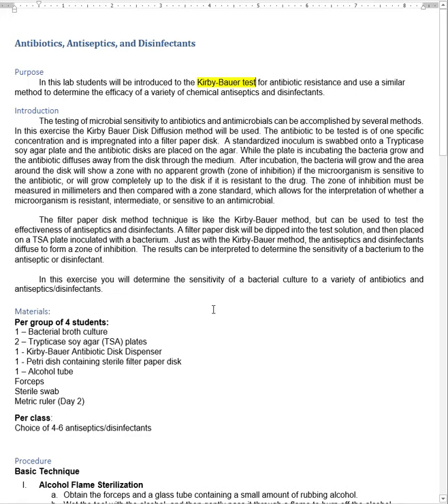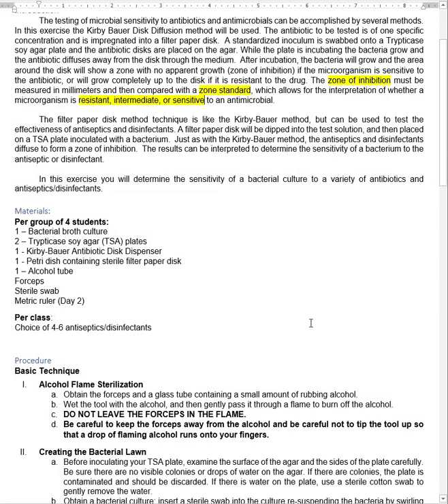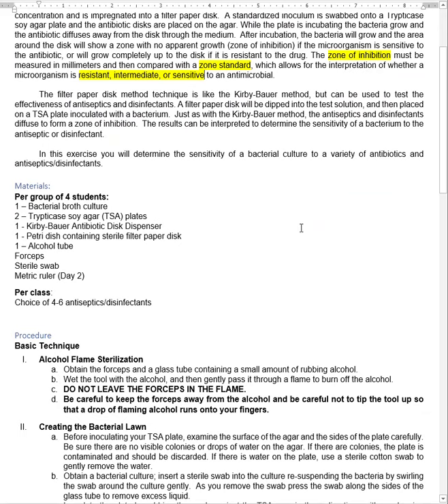So you have these discs, a circular, and then there's a circular cleared area. The larger the area that's cleared, the more sensitive that bacteria is to that particular antibiotic or antiseptic or whatever. So that's how we measure it. That cleared area is called the zone of inhibition. That's one of those things you need to know. We take that and we compare it to a zone standard. We have one at the end of this lab, and it's going to give us the bacteria's how resistant, sensitive, or whatever it is to it. Kirby-Bauer is pretty easy. It's one of the more fun labs we can do. And even though we can't do this in our actual lab, they do have a simulator at the end of the lab, a link to it, and I strongly suggest you go there.